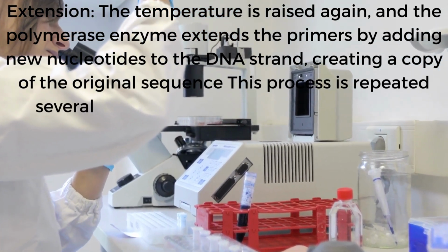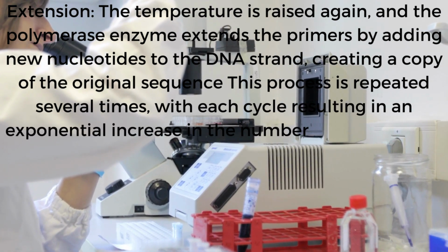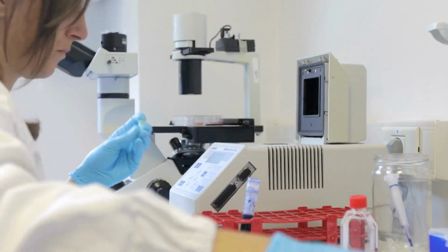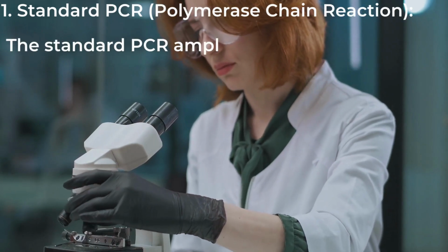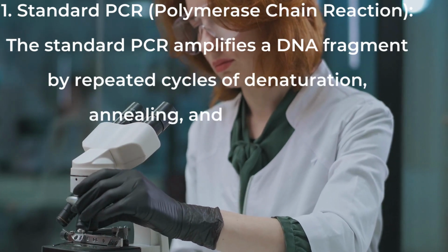This process is repeated several times, with each cycle resulting in an exponential increase in the number of copies of the targeted DNA sequence. Now we discuss types of PCR. 1. Standard PCR, polymerase chain reaction. The standard PCR amplifies a DNA fragment by repeated cycles of denaturation, annealing, and extension.